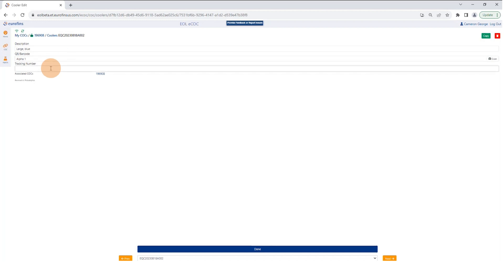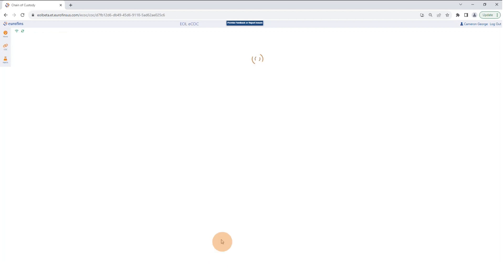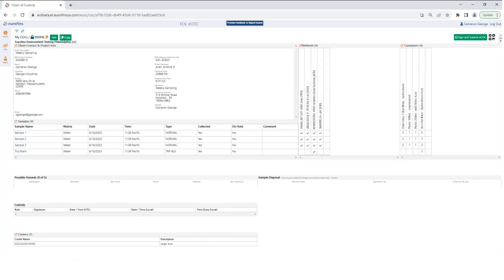We also have a field for a tracking number. If you're sending your samples via FedEx, UPS, or an outside courier and you have a tracking number, you can type that in here so the laboratory has another means to reference that cooler with the electronic chain of custody. When you're done with your coolers, hit Done, then hit Done a second time, and you'll be taken back to the front page where you'll see the coolers included.